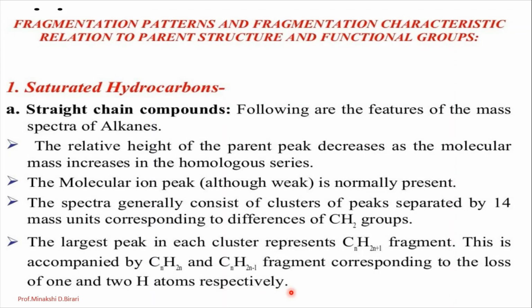So in straight chain alkanes, there is fragmentation of each and every carbon-carbon single bond.